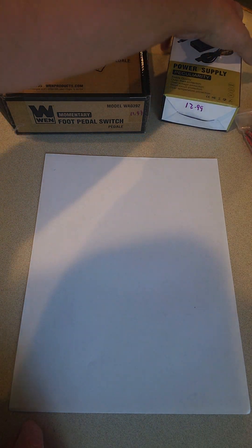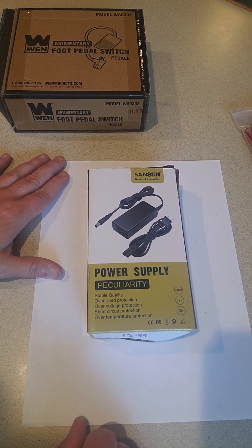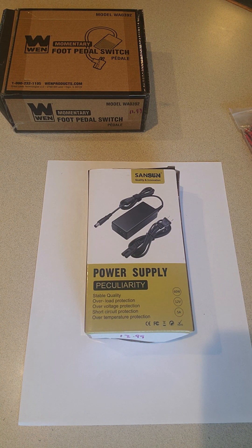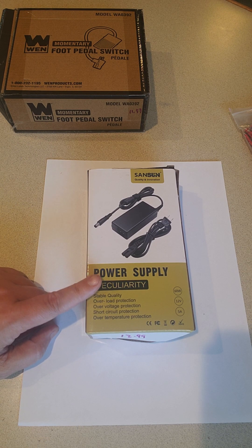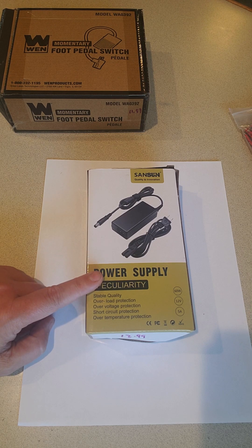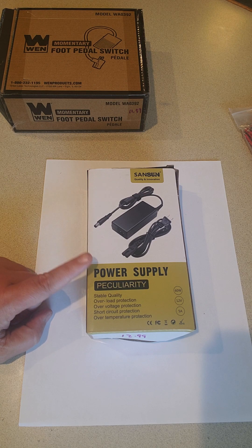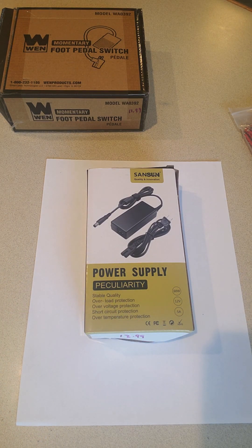The second thing you're going to need is a power supply. You want it to be 5 amp, 12 volt, 60 watts. Be careful when buying these because sometimes the companies will lie about the specs — they'll use inferior products and so they won't work. I will provide some links in the comments to this specific power supply because I know it works. If you're going to try to find different options, I recommend ordering from somewhere like Amazon that has a really good return policy, because you might get it and find that even though it says 12 volts 5 amps, it's not going to actually work with the system.